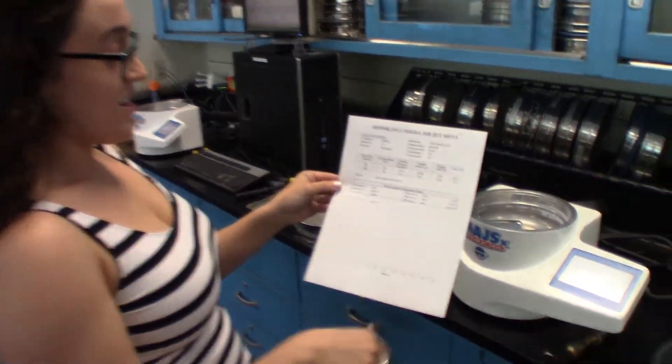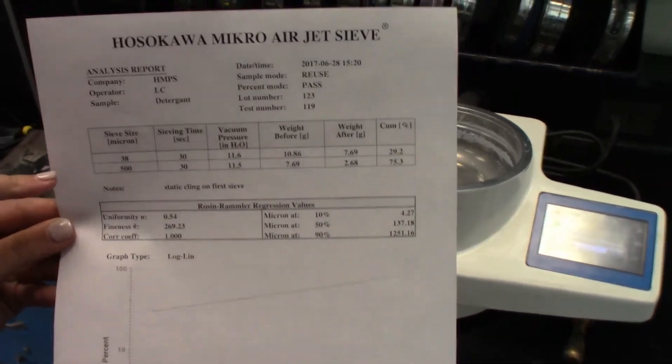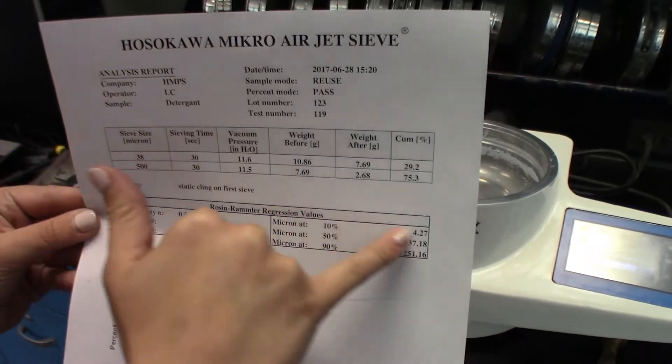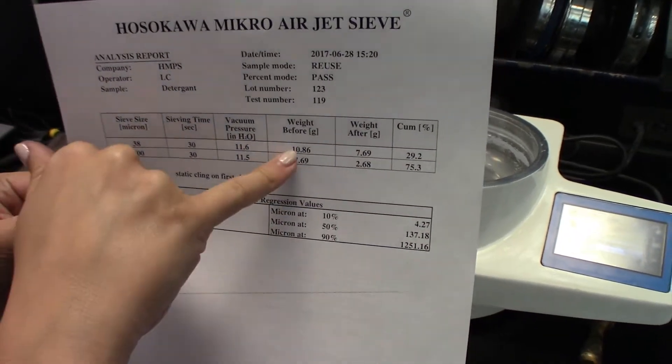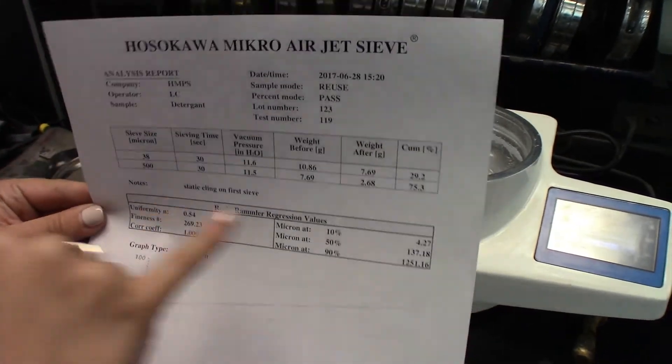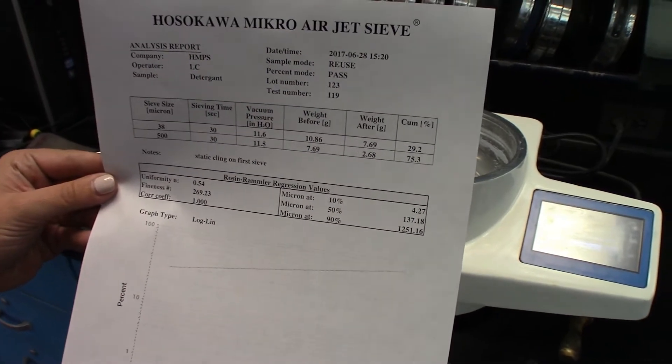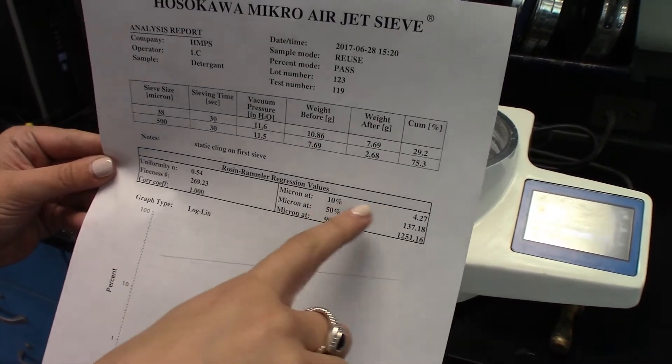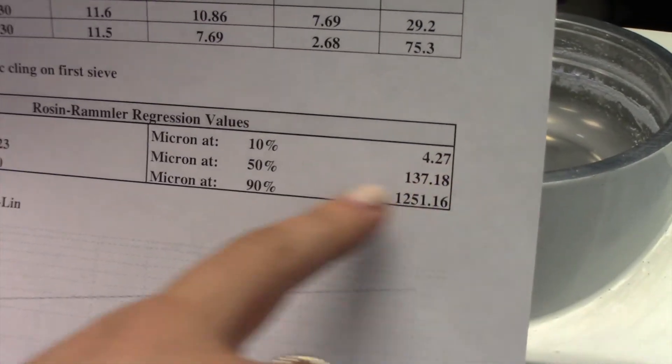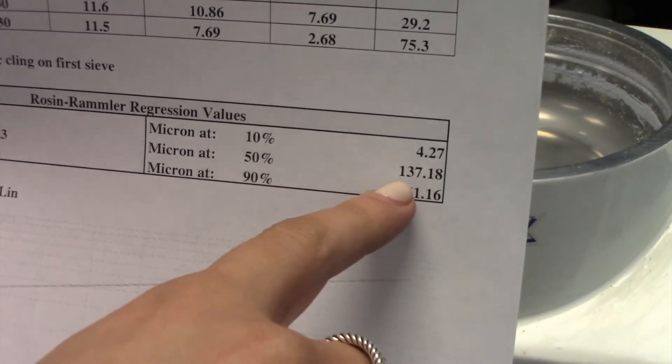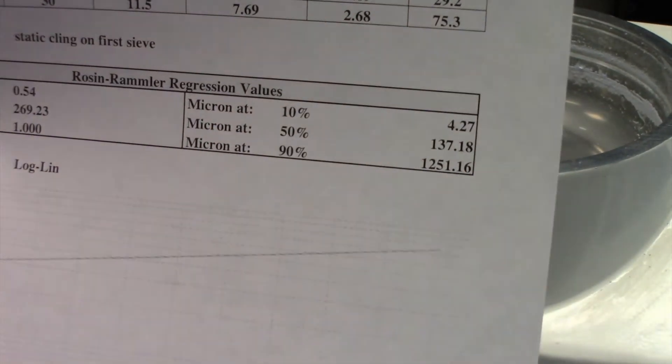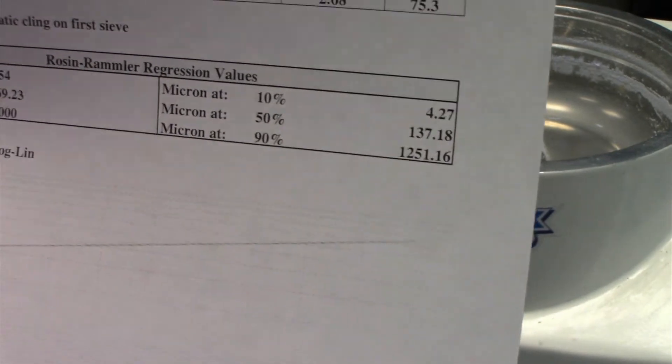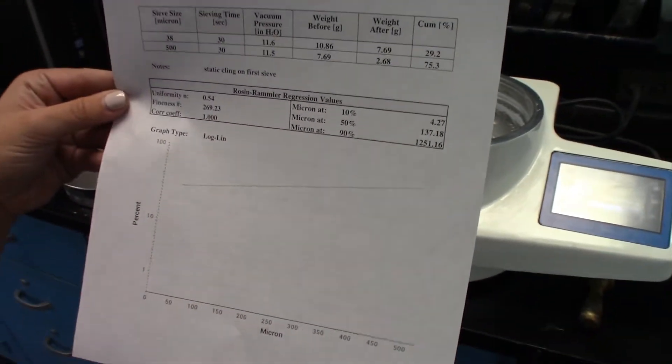As you can see here, it shows us the sieve sizes that we started with, our sieving time, the vacuum pressure, our weight before and our weight after. So out of the 10.86 grams that we started with, 2.68 grams were retained on top of the sieve screen. My D10 is 4.27 microns, my D50 is 137.18 microns, and at my D90, it's 1,251.16 microns.